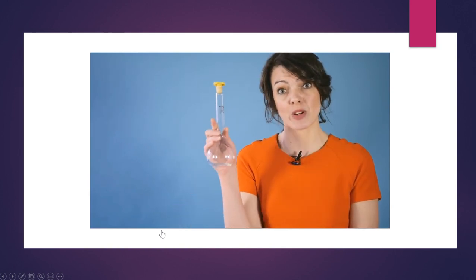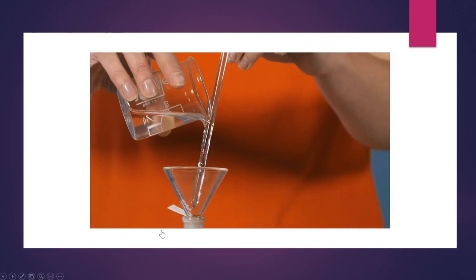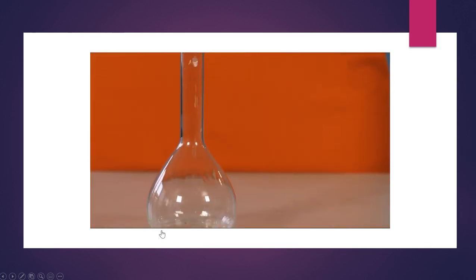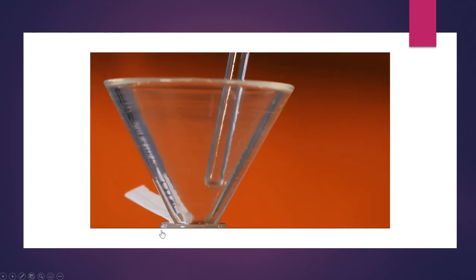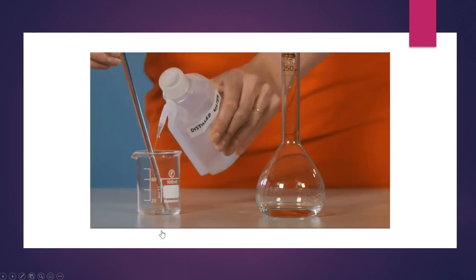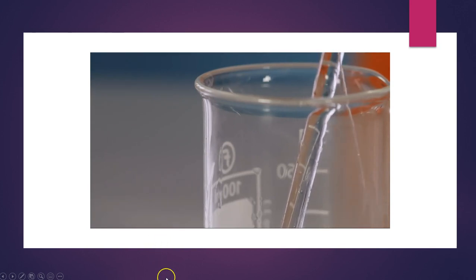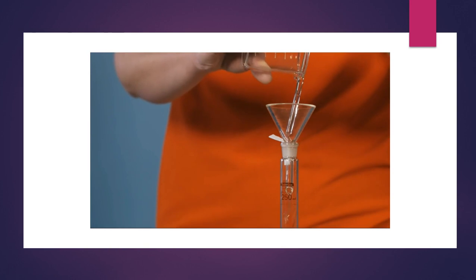For the next step, you'll need a 250 centimeter cubed volumetric flask and a funnel. Pour your solution down a glass rod and through the funnel into the flask. Make sure to raise the funnel so that it drains smoothly. To make sure all of your sodium carbonate solution is transferred to the volumetric flask, you should use a wash bottle to rinse the beaker. Make sure to add this rinse to the volumetric flask each time, and do this at least 3 times.